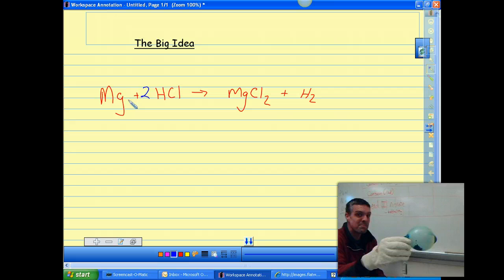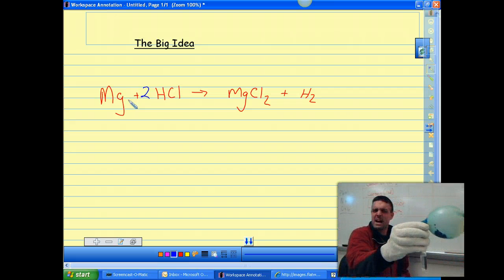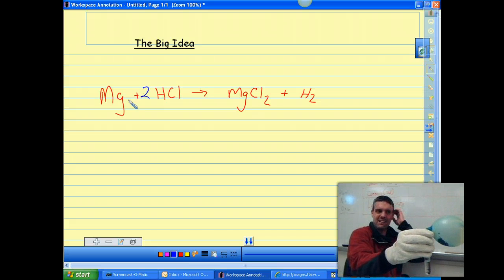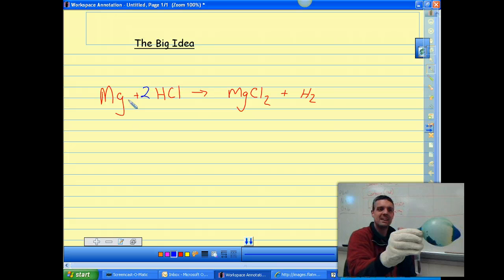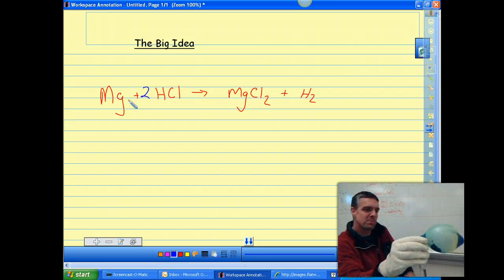Okay, we definitely produced some hydrogen gas. I don't want to hold this for long. I don't want it to degrade in there and pop. But the magnesium in there went quick, didn't it? Didn't take much. So hold on, I'm going to go put this down. I'll be right back.